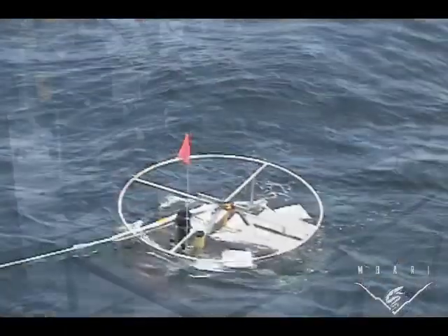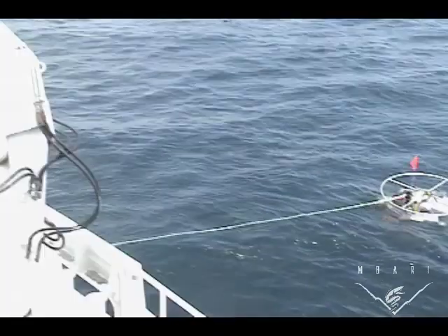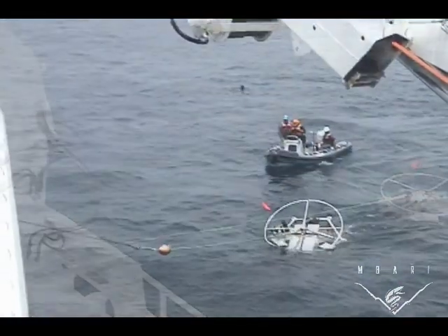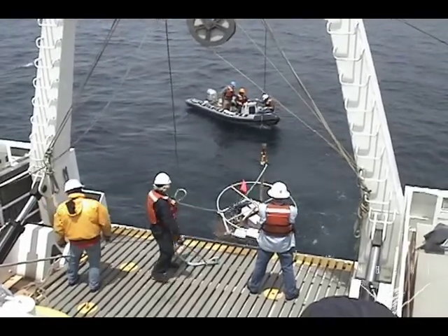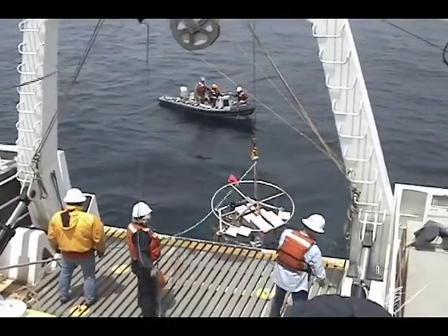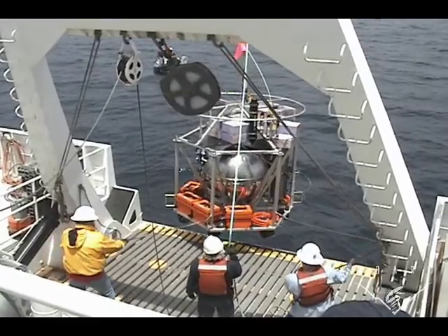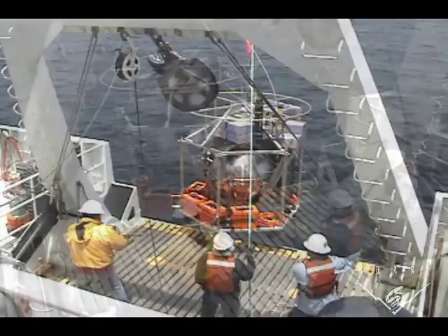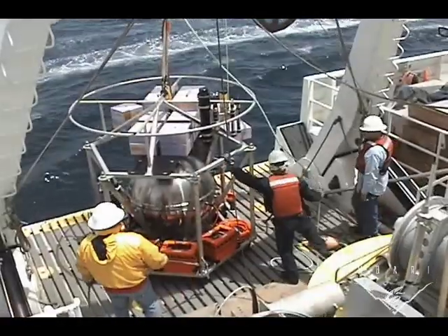Meanwhile outside, we've spotted the deep ESP, and they send a rib boat out to secure it and get a line to it, and we use the A-frame on the back of the Western Flyer to lift it back onto the deck. As soon as we get the ball on deck, we can plug in and simply download the data as though we were copying files from one computer to another.